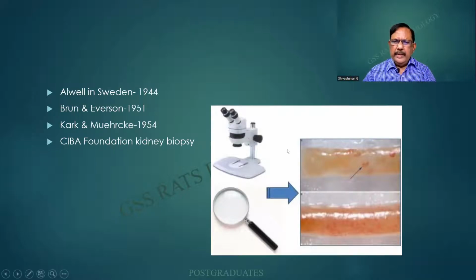This I shall come to later, but then even after a biopsy, it is supposed to be inspected under a hand lens or a dissecting microscope.